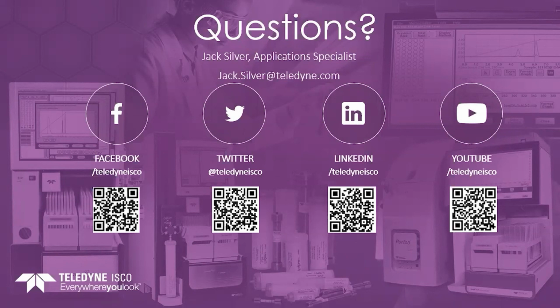If you are installing the column for the first time, when you're editing the gradients, there's also a scouting gradient button there that you can choose. If you're using most C18 columns or most columns, I like to set the initial %B to 5%. If you are using a C18 AQ column, you can start at 0% B.